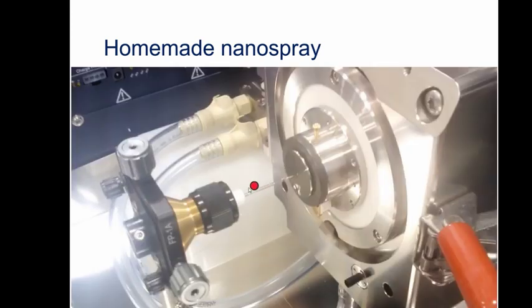If we zoom in and see the picture here, you can probably just faintly see the surface of the liquid in there. You can't see the wire, you can just see the end of the crocodile clip there, and the other end is down here. And it is as simple as that. We got better performance out of this very, very simple setup than out of the commercial Bruker nanospray setup, which is what we went there to build here. So sometimes it is worth modifying your ion source if you want to see more interesting and useful things.